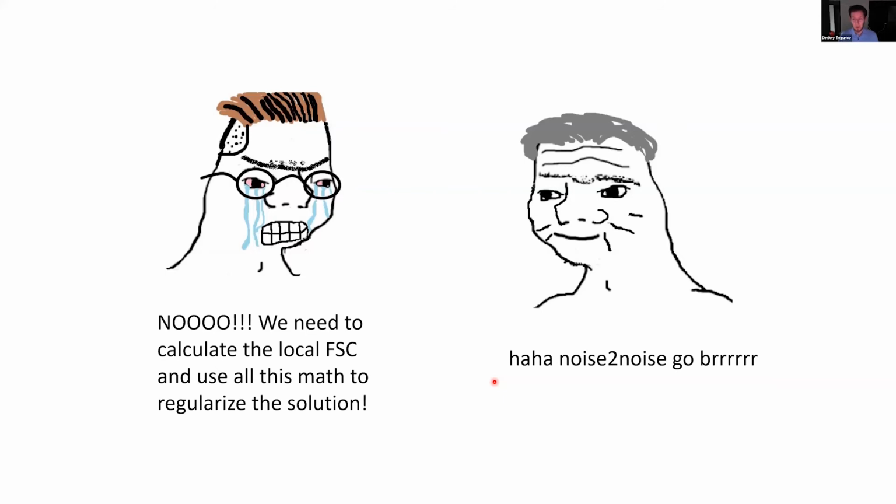On the other hand, I was, of course, quite happy because it worked very well. So you have to imagine this neural network, it doesn't know about the existence of FSC, has never heard any discussions about the correct FSC thresholds. It doesn't even know who Marin is. And yet it manages to filter the maps very nicely to local resolution.